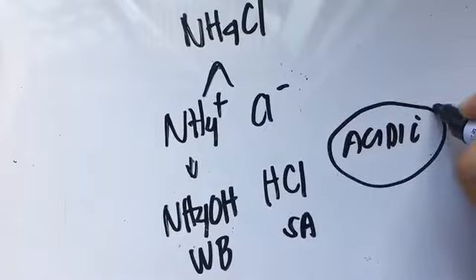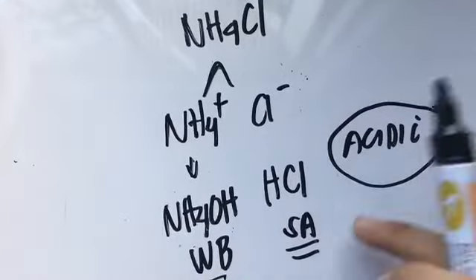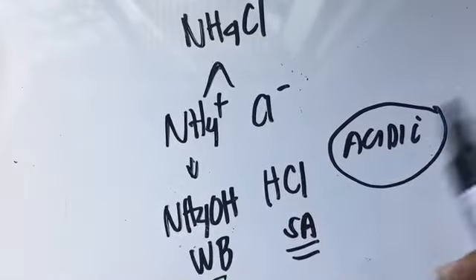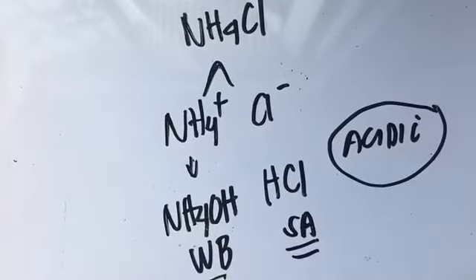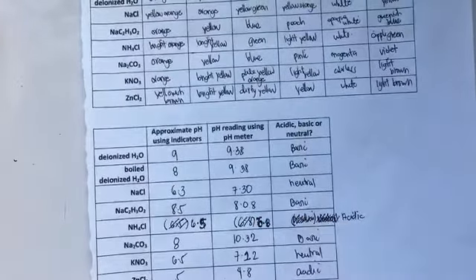So, it will form an aqueous solution which is acidic. Following yung sinabi natin kanina na kung sino ang mas stronger sa kanila, yun yung magiging pH ng ating solution. Kasi mag-i-emit siya ng cation coming from the conjugate acid of the weak base. So nagko-coincide ba 'yon sa data natin? Yeah. It coincided with the data.